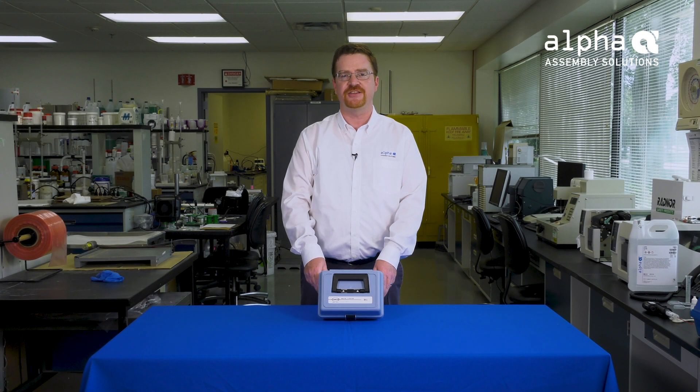And now you know how to use Alpha Titration Kit Number 3 to measure the acid number of a liquid flux. Thanks for joining me today. Good luck and happy titrating.